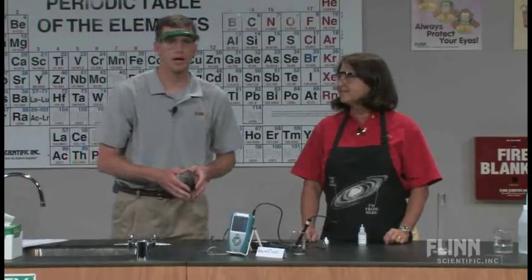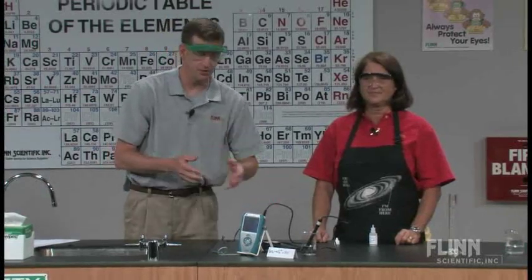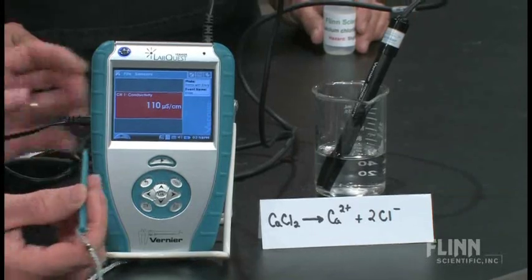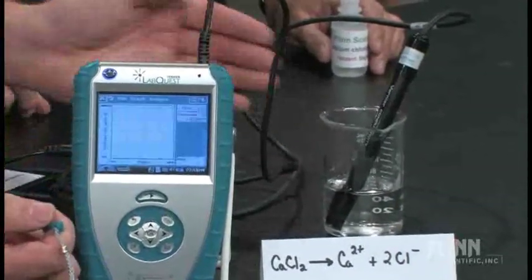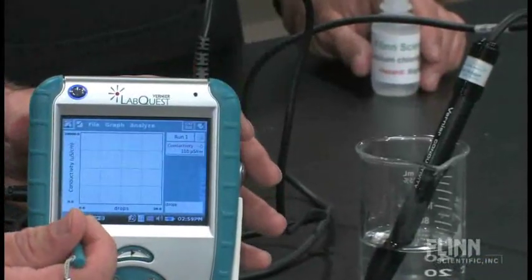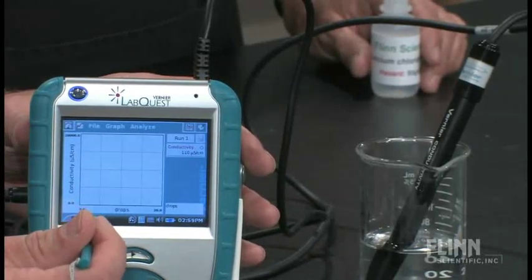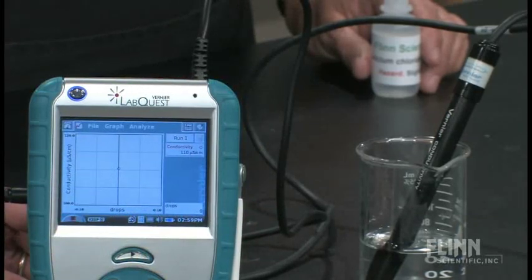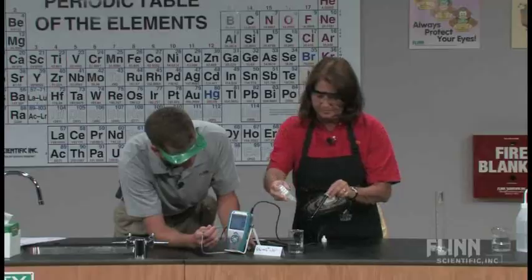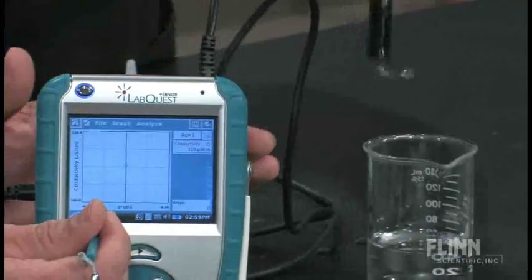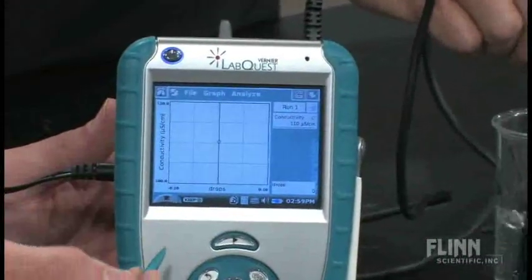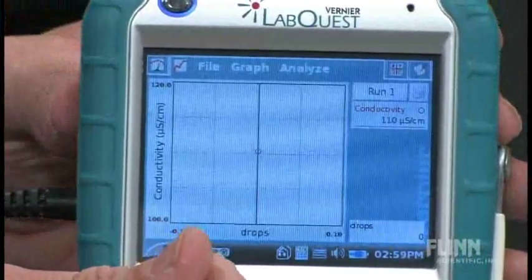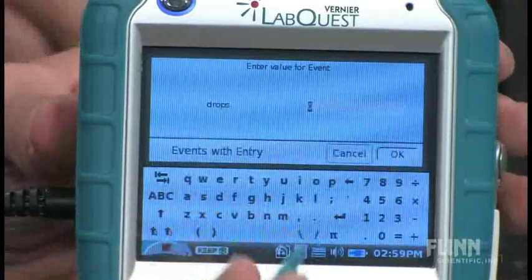Now what we can do is take a look at how calcium chloride concentration affects the conductivity in the beaker with a solution that has a dissociation of calcium chloride to Ca2+ and 2Cl-. Again, we'll get a baseline reading on our tap water. I have 70 milliliters of tap water, and we're going to drop drops of one molar calcium chloride solution into that. I want to keep it at about 110 microsiemens, and we have put no drops of calcium chloride. If you would put one drop of calcium chloride in and give it a pretty good swirl. Keep that. That was one drop.